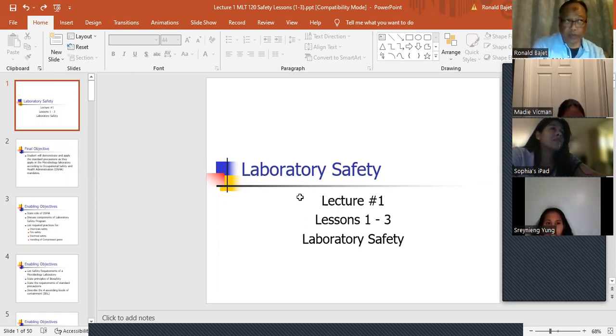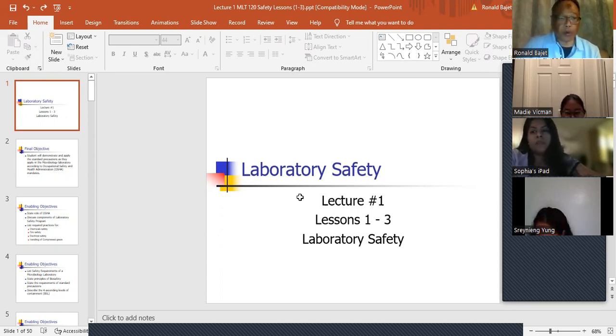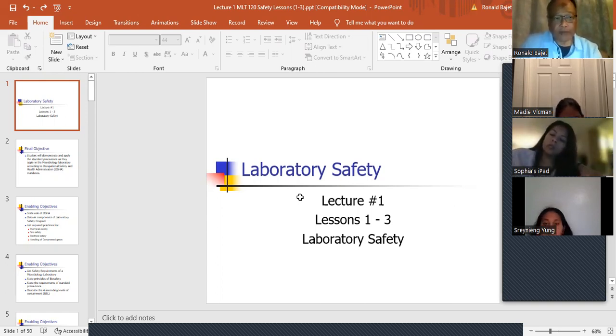So you have to do a procedure called the acid fast stain, where it uses carbol fuchsin. There's a cold stain and there's a warm stain. So we're going to do both stains, the Kinyoun and the Ziehl-Neelsen. It's where you take a flame and you heat the slide until you see steam, and then you rinse it, and then you look at it under the microscope. It's really important to make sure you know that you have acid fast bacteria on your slide, because especially for tuberculosis, as you know, it's pretty contagious. If you see anything that's red from the acid fast stain, it's a positive stain. You see red rods, it's positive.